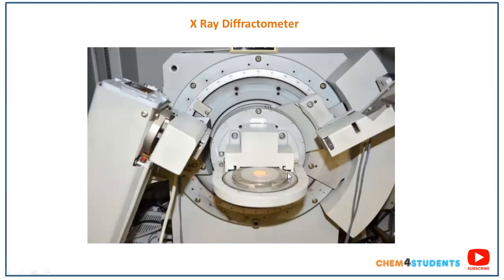Now we need to send a monochromatic beam through the sample, move the detector around these different angles, and record the diffraction patterns of the sample. Finally, interpret the diffraction patterns to determine the compound. This is the whole process. But how do you put it into practice? How do you interpret diffraction patterns of crystalline substances? I will show you how to interpret diffraction data in this section.